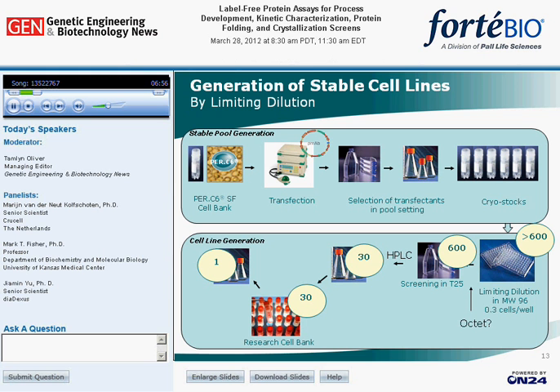Unfortunately, volume and concentration in the 96 well format are too low to be detected in the protein A HPLC method that was routinely used at that time. Therefore, it was decided to evaluate whether the Octet protein A assay could already be used in the 96 well stage. But before this evaluation was started, it was first tested whether the HPLC and Octet-based IgG assays would give the same results.